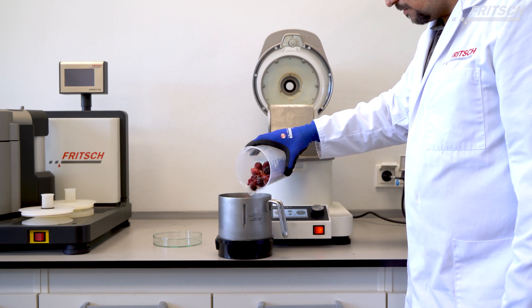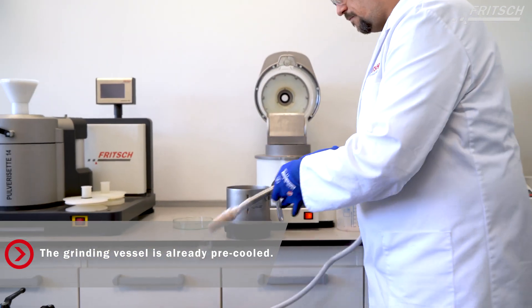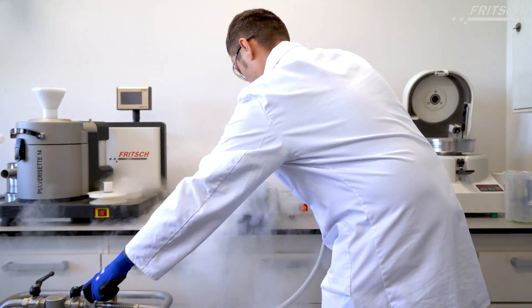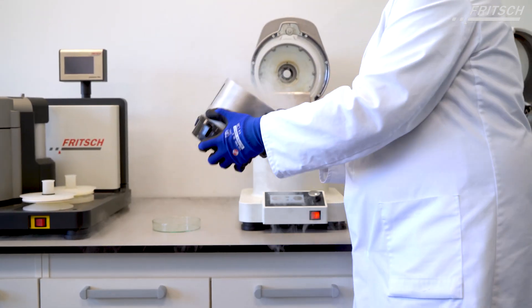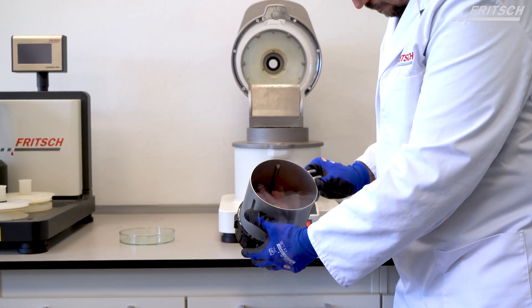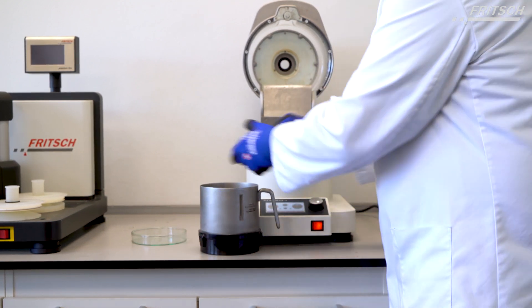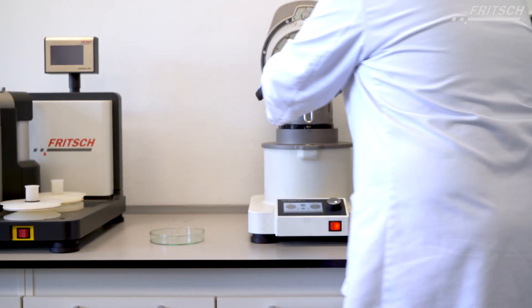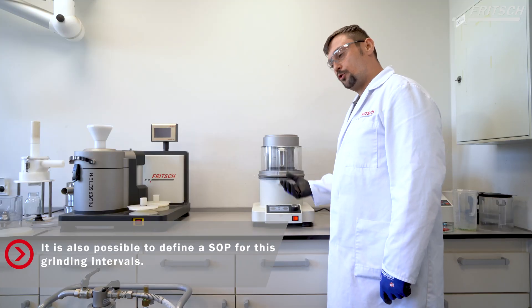Now we grind in intervals, which is important for a more homogeneous sample.